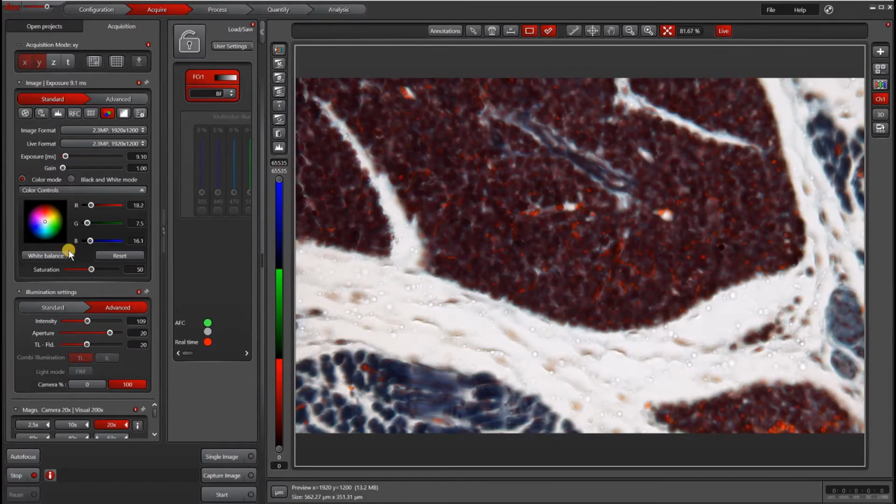There, that's better. So at the bottom of this color control, we can adjust the saturation, so you can intuit how that works. On some occasions, people accidentally set the saturation to 0, in which case it appears monochrome. So I would put this at 50 as the default.